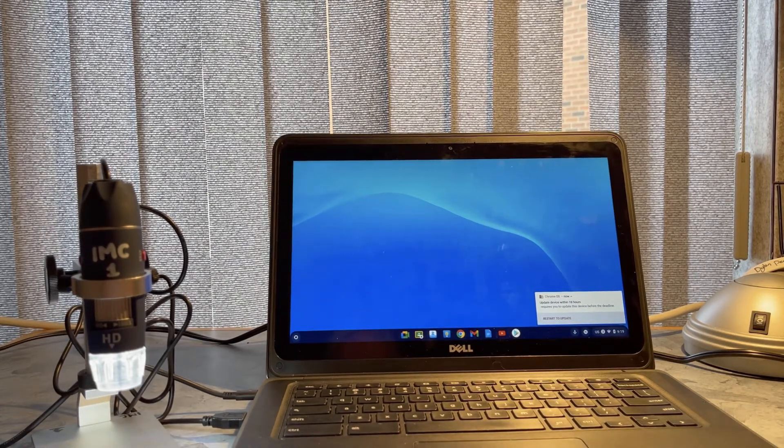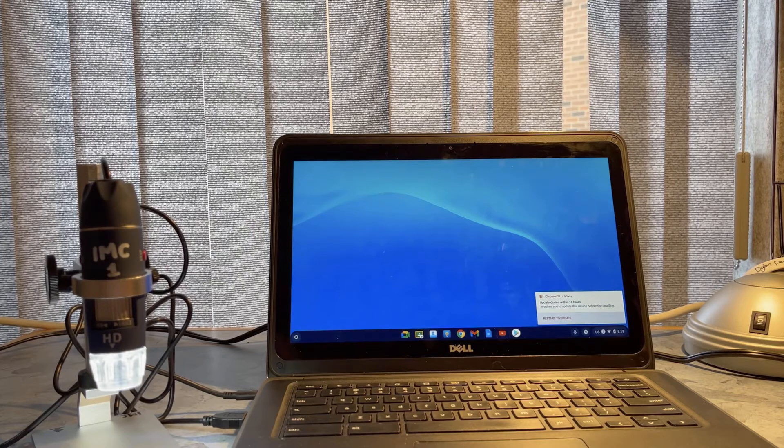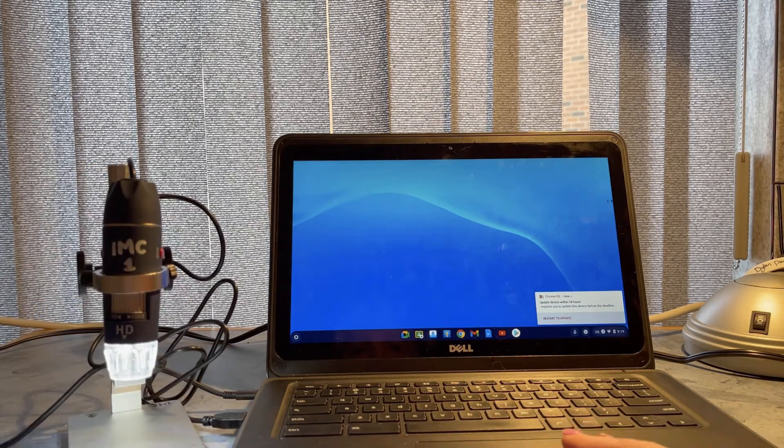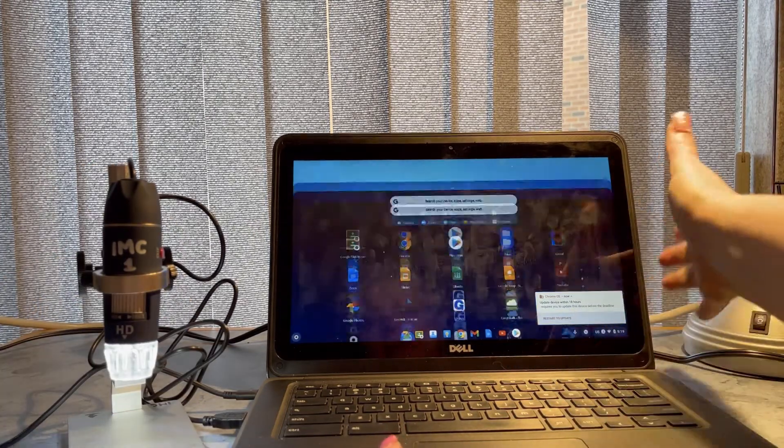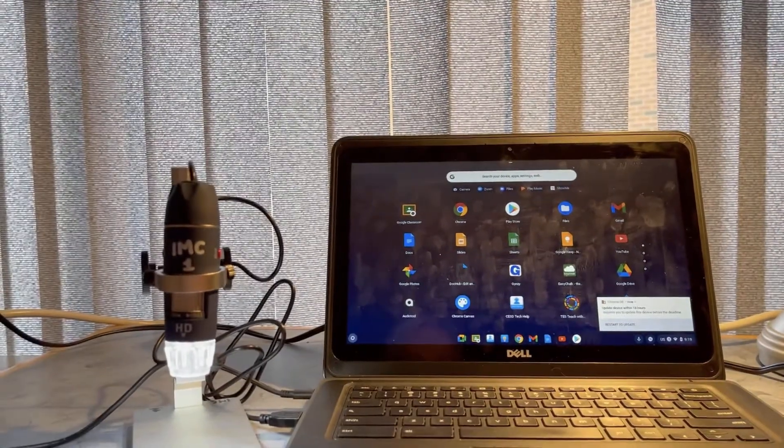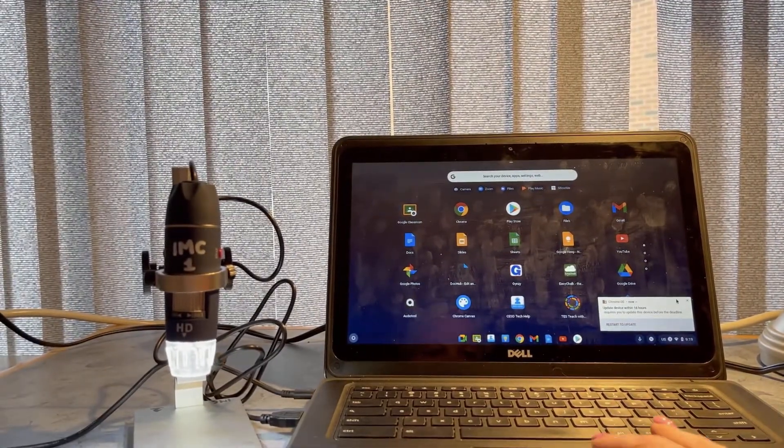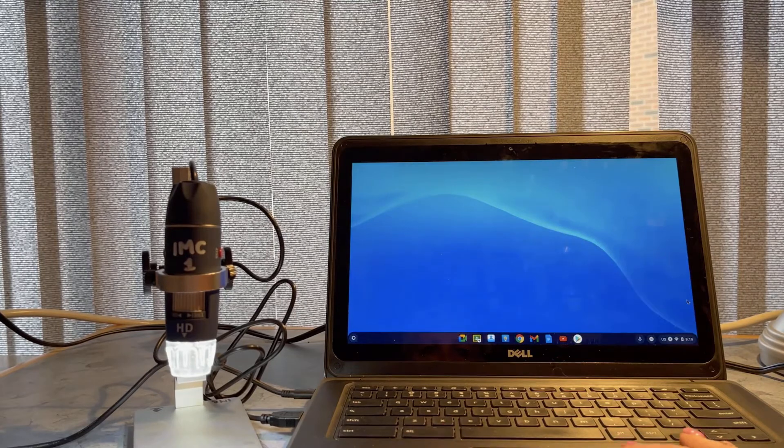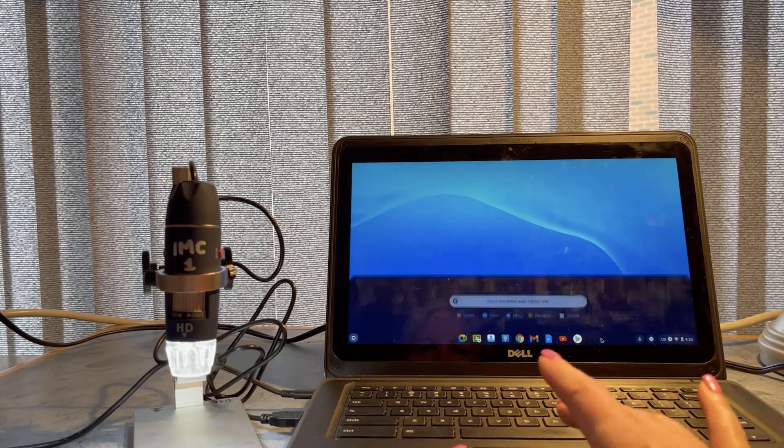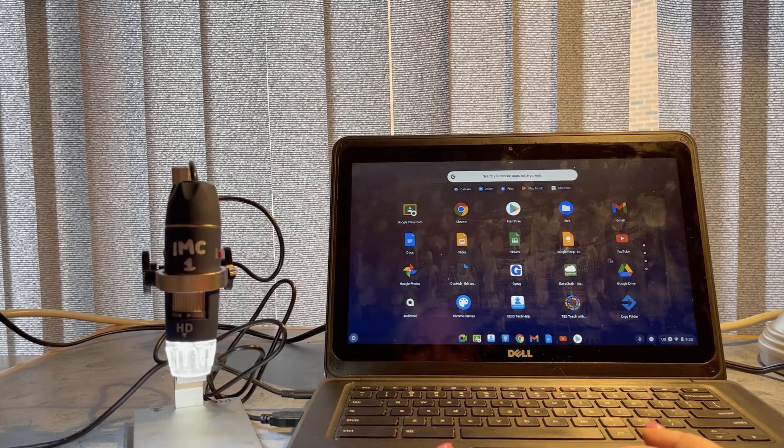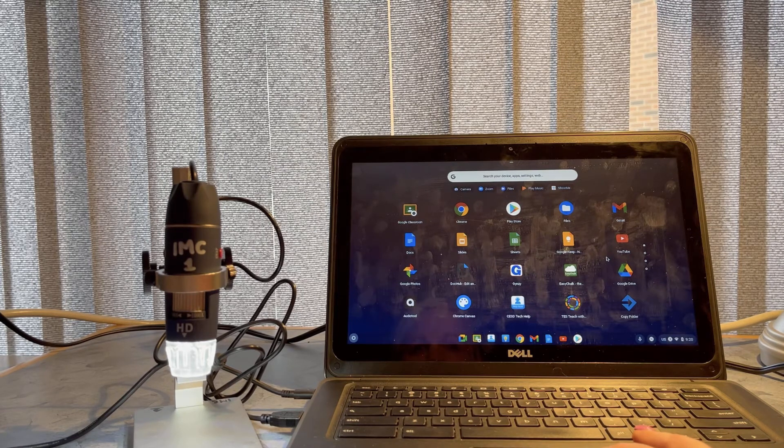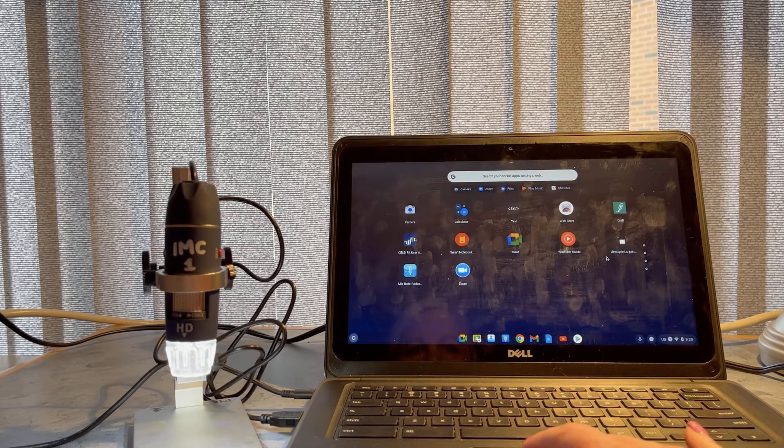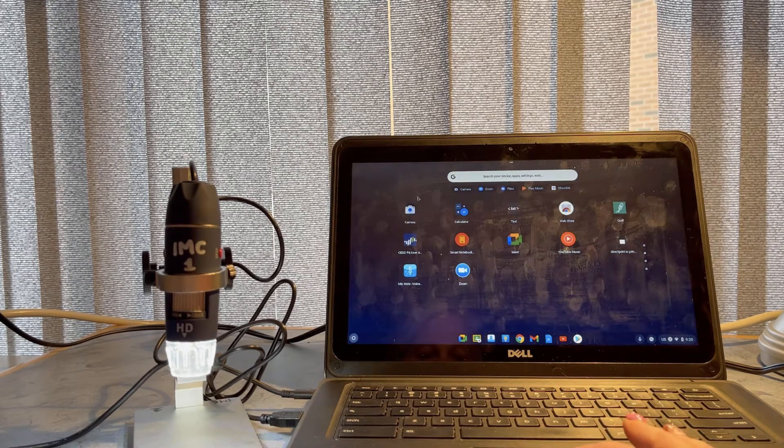It's turned on its light right away. Now to use this, I'm just going to go into my apps for my Chromebook. Let's close down the notification here and go back into those apps. I'm looking for the camera app that comes with the Chromebook. There we go.